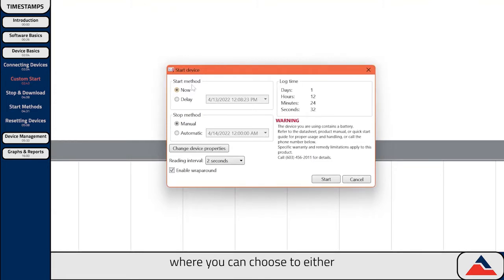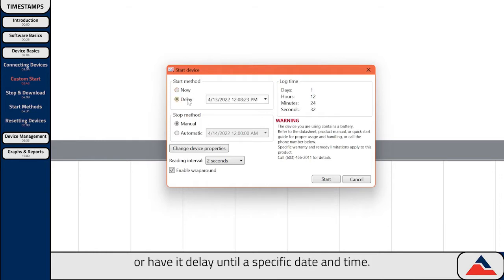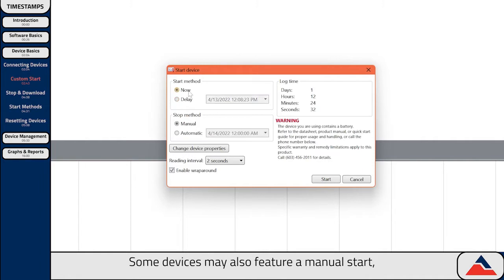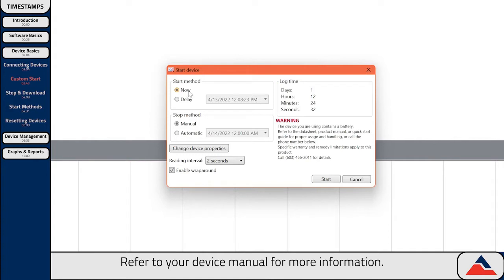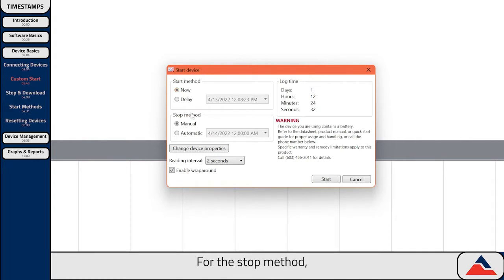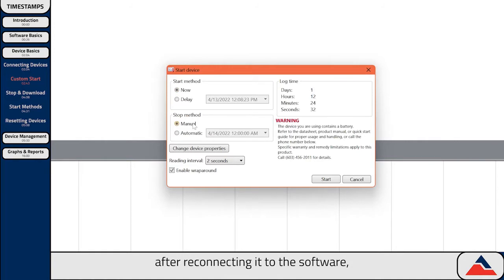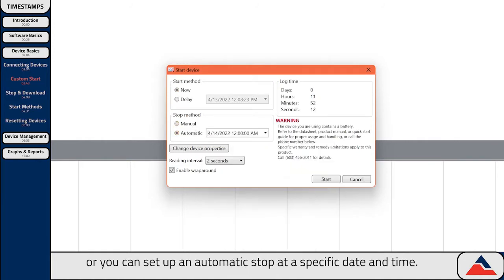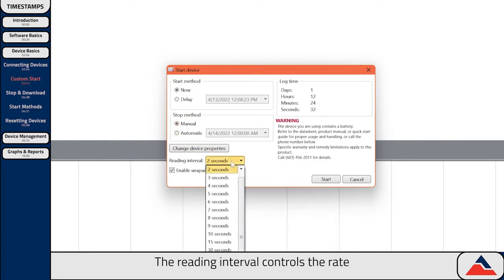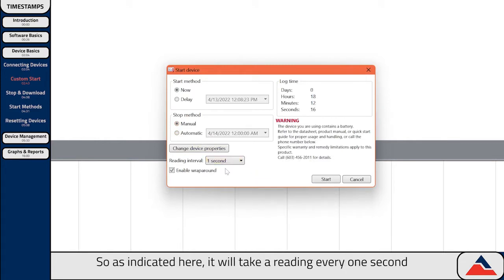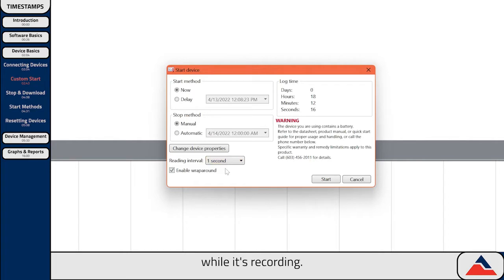First is the Start method, where you can choose to either have the logger start recording immediately, or have it delay until a specific date and time. Some devices may also feature a manual start, which means you can start the device with a button located on the device itself. Refer to your device manual for more information. For the Stop method, you can either manually stop the device after reconnecting it to the software, or you can set up an automatic stop at a specific date and time.